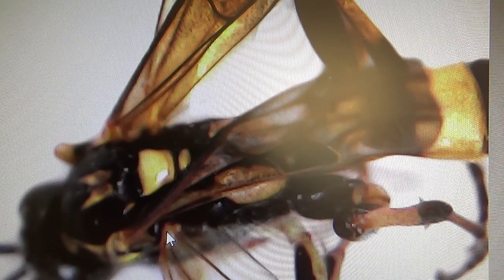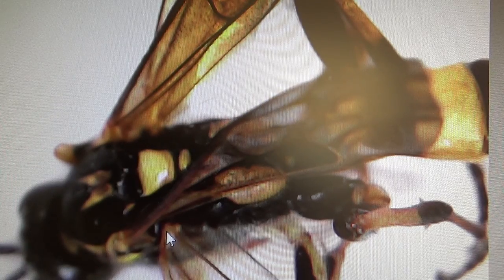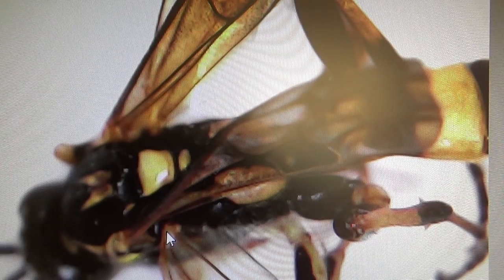This little microscope hooks up to the computer, and then you can just see it on the computer and move it around to how big you want it. Really neat.